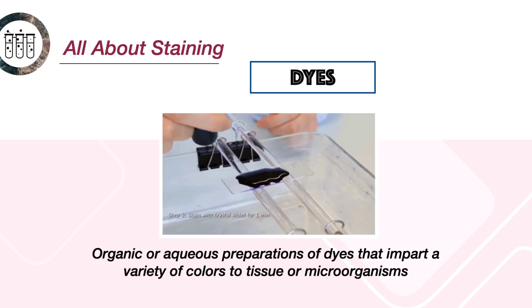Now, it is not enough that we have a stain. Apart from choosing the right stain, you would also need to consider what your goal in staining is. Not all stains are created equal. Do you remember histopath? Of course, it's still fresh, our struggle in histopath. Do you remember the topic on stains? With those things in mind, you can now picture how bacterial stains function as well.